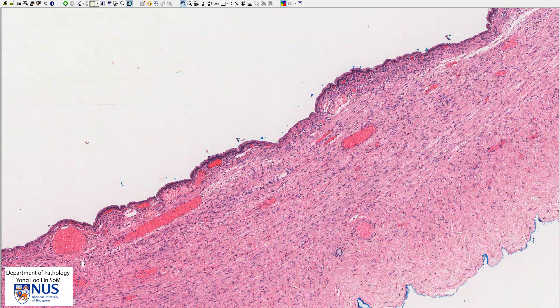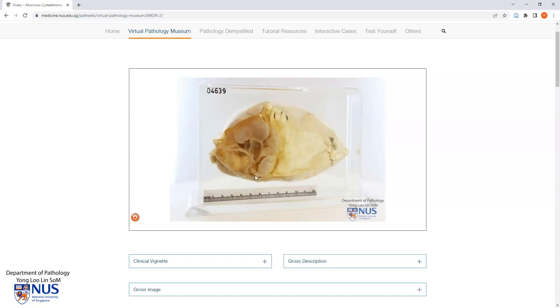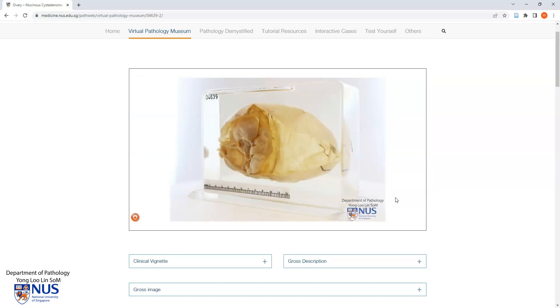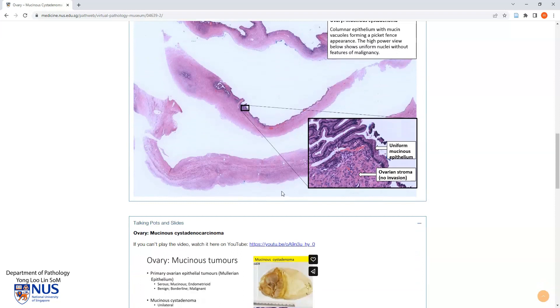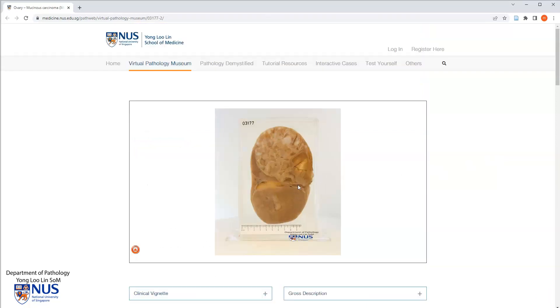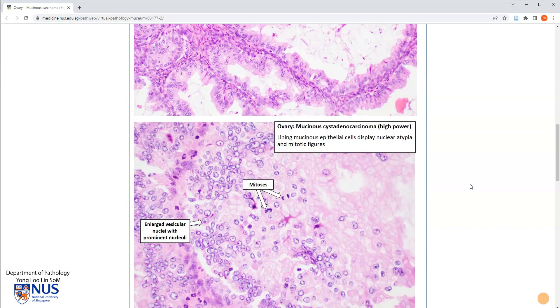Let's have a quick look at the gross appearance of a mucinous tumor. Here we have an example of a mucinous cystadenoma — there is a separate video describing the gross appearance, but you can see this is a multi-loculated cystic tumor with a very thin and translucent cyst wall and no obvious solid areas. You can scroll down to see gross descriptions and annotations for microscopy. I would like to quickly contrast this with a mucinous carcinoma, which shows a lot more solid areas.